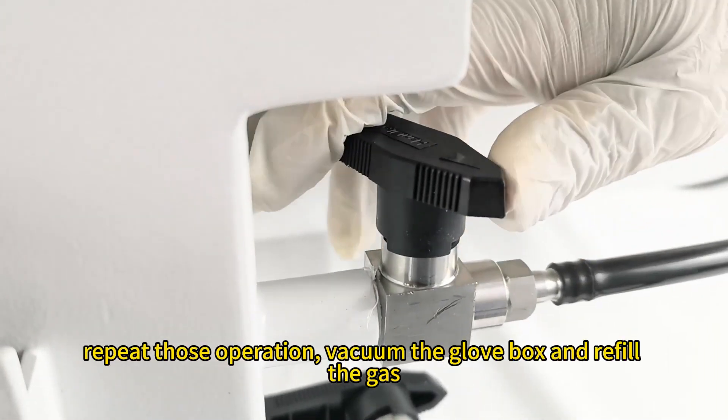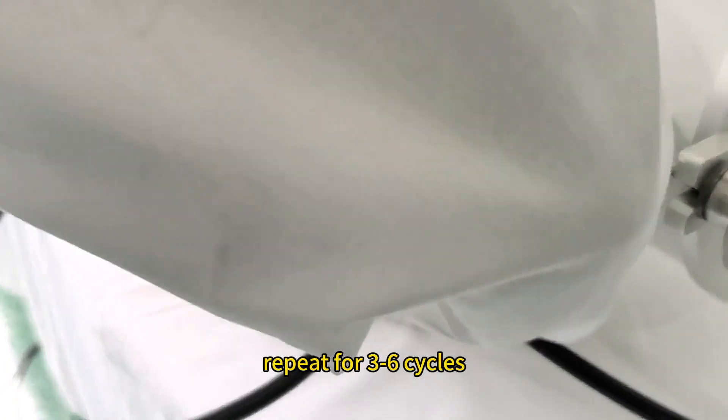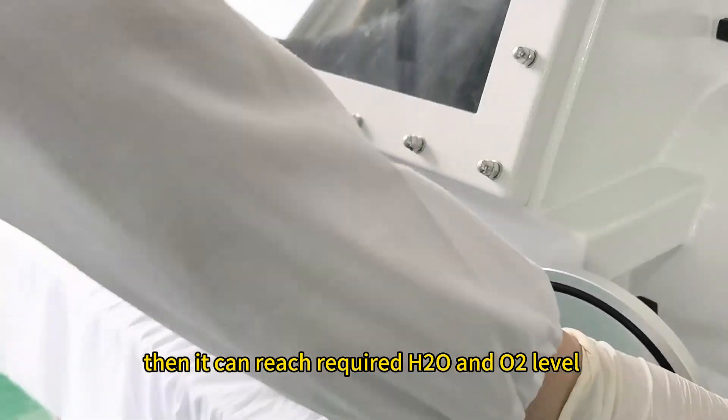Repeat those operations: vacuum the glovebox and refill the gas. Repeat for several cycles, then it can reach the required H2O and O2 level.